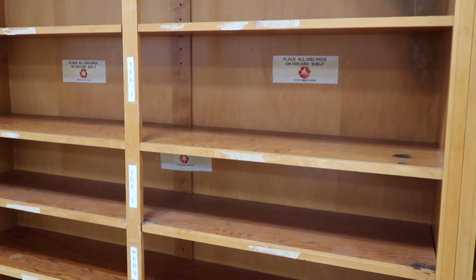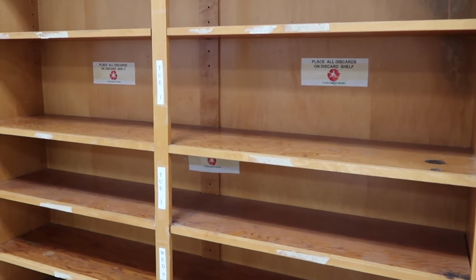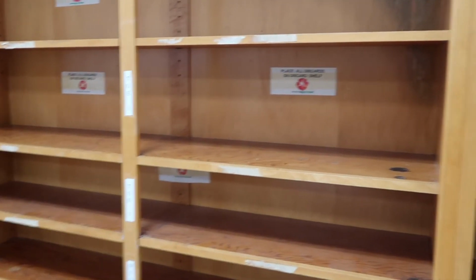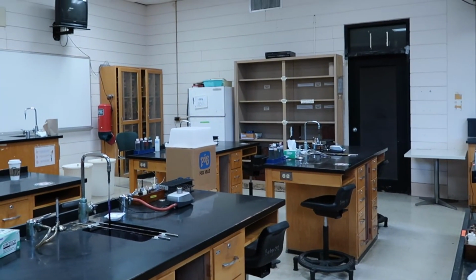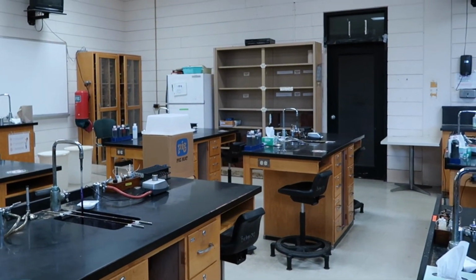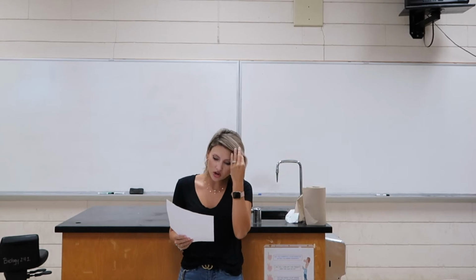This is not the discard shelf, however. Make sure that you don't get these two shelves confused. The discard shelf is on the other side of the classroom. That's where the trash is going to go. So make sure that you don't get these two confused. All right, so the answer to that number 14 question is yes, that you are aware of the difference between the two. Number 15, what is the greatest danger faced by students in this lab?